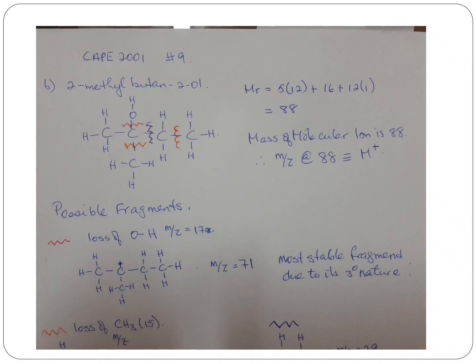I know that based on the total mass of my compound, my molecular ion, if I had one, would be at a mass-to-charge ratio of 88. Now you can start to play with some math here and determine, okay, if I have 88, what mass do I need to lose to then give me a 73, 71, 59, and 56?